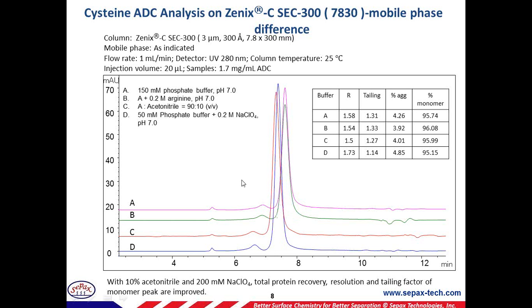Of course, we talk about all these additives to improve our LC peak shape and tailing factors, but these additives also need to be evaluated for whether they change the protein conformation or stability. So another orthogonal method should be added to confirm whether these additives change the protein, and whether the protein stays the same under these conditions. So more evaluation is needed on your end with the molecule you have, when you're adding all these additives, to see if anything changes.